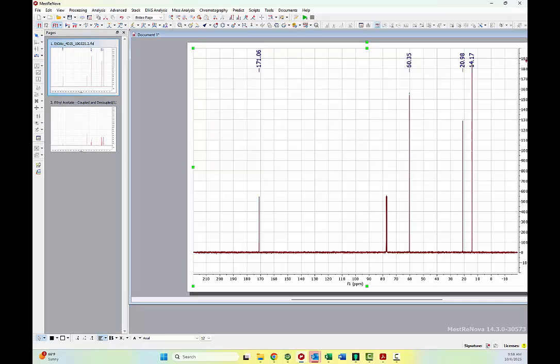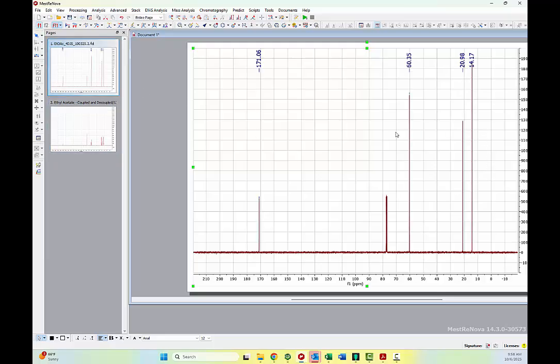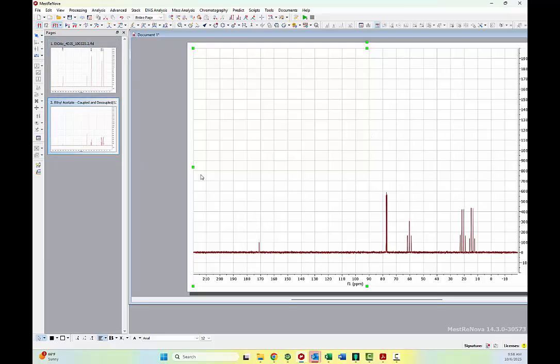We get up to nearly 1900 over here, and the carbonyl is about 500, whereas if you look at the coupled spectrum where you have quartets and triplets and singlets, then everything's much smaller. This is nearly 5 times lower, and this is likewise about 5 times lower, and so there is a dramatically worse signal to noise. It is much easier to see singlets in the spectrum than it is to see the coupling information. Now, you lose some information when you do this, of course.